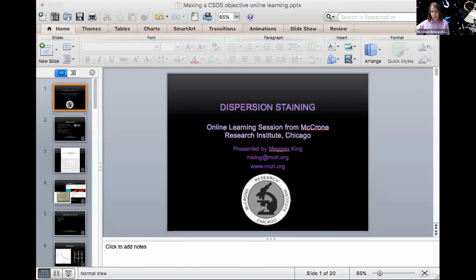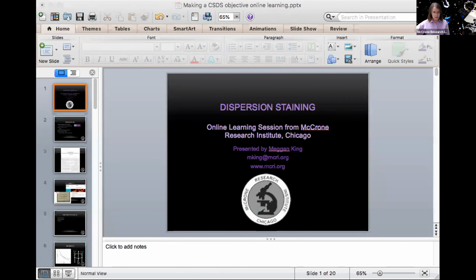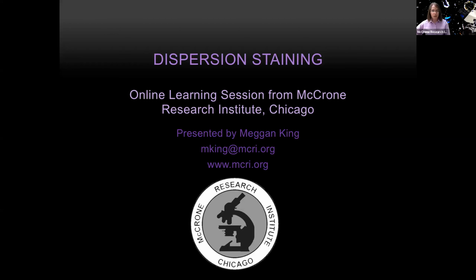Let me just make sure we've got a good internet connection and things seem to be going okay. So let's get going. I wanted to go through a few things. I have a brief PowerPoint presentation, and then we'll go on with setting up our microscope and making our central stop dispersion staining objective. So let me share my screen with you. All right, there we go.